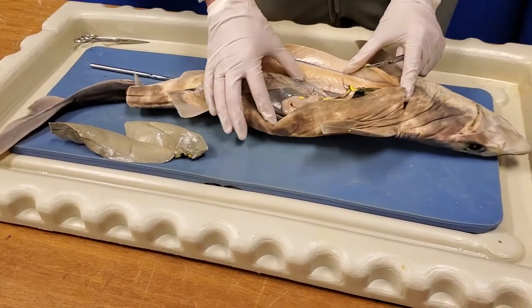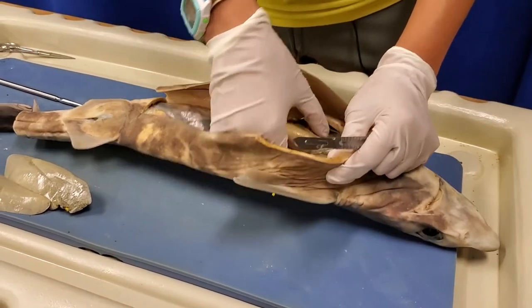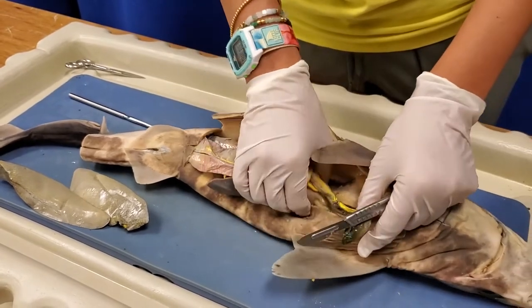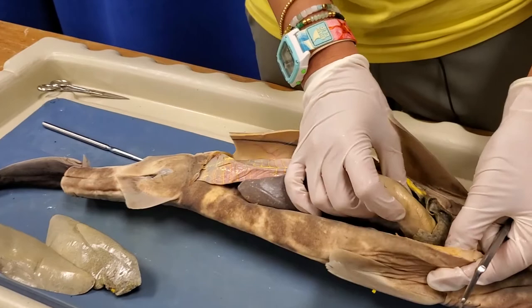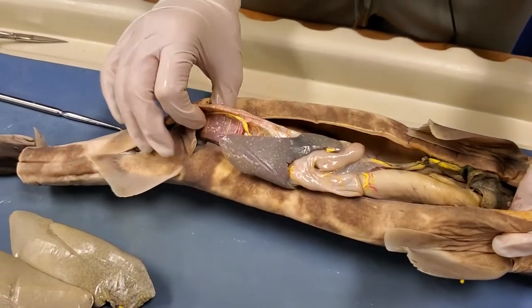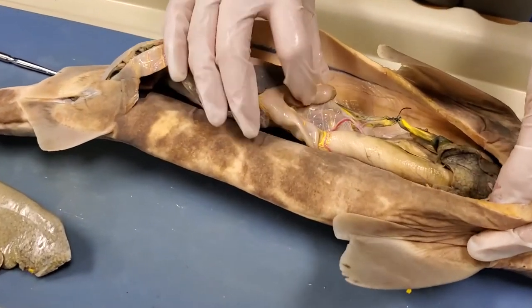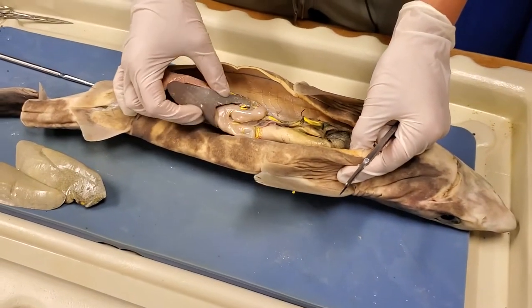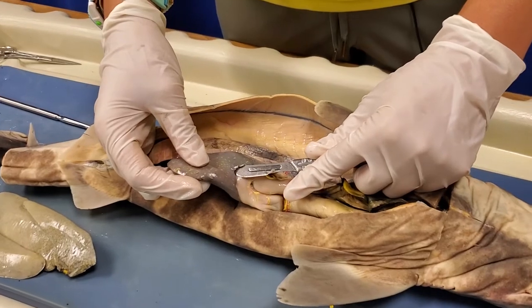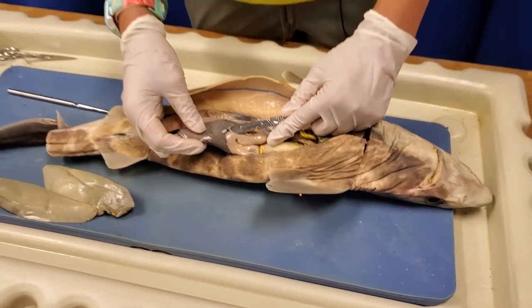A shark's digestive system is pretty different from ours — it's a lot more straight, like a big long tube running all the way down. This is the upper portion of the stomach, running all the way down to where it becomes the intestines. This curvy area is the duodenum, the entrance to the small intestine. Attached to the intestines is an organ called the spleen, which you and I have as well. It's important to our immune function, but in a shark it serves a slightly different purpose.